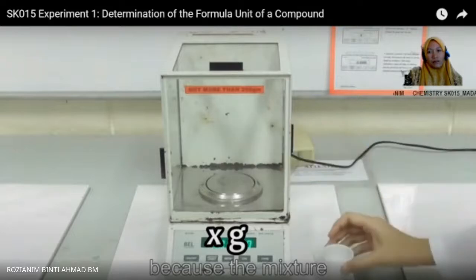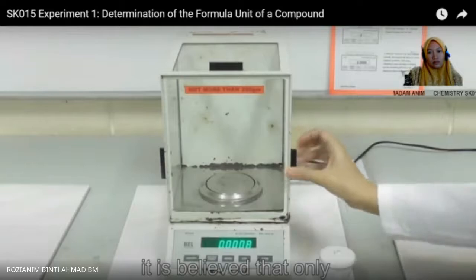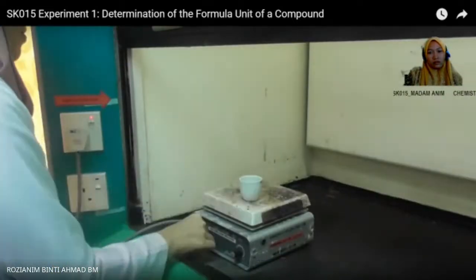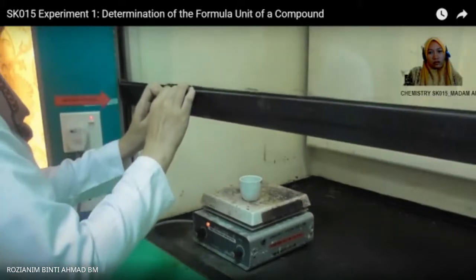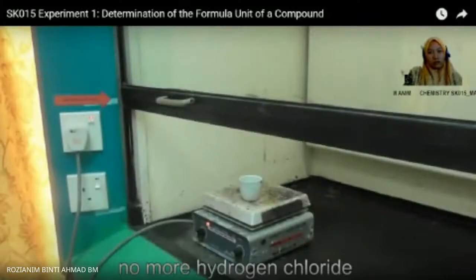Mixture is dry. Therefore, it is believed that zinc chloride is left in the crucible. What if it is not true? How to measure? Reheat the mixture again. If the mixture is really dry, no more hydrogen chloride and water can be removed.